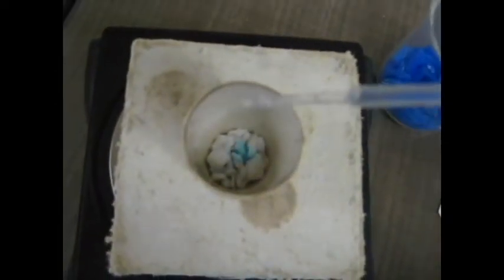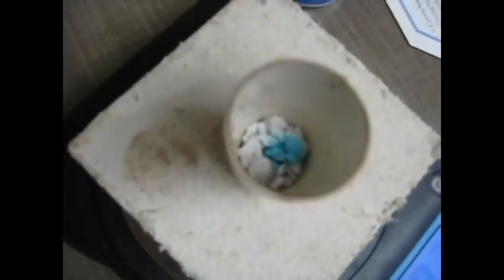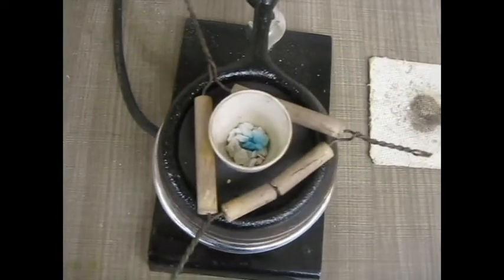1, 2, 3. I actually added 4 by accident. So notice that that gives it back its blue color. Now it's like rehydrating, just like when you want to get hydrated, you drink some water. Well, now this chemical is sort of drinking up the water, let's say. So now if I put it back on my hot plate, I can get rid of that.